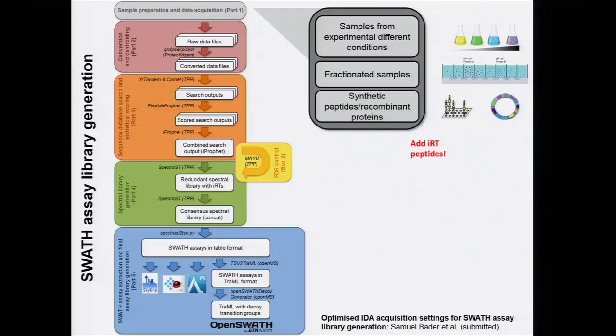But we basically add this in pretty much every sample we run in the lab that might ever have a chance of going into a spectral library. This is worth doing, or it can be any of the kits. Or Ariel also mentioned that some people have done work on finding peptides that commonly appear as contaminants, for example, from keratin or from filamentous proteins, or proteins that are highly conserved across species, or trypsin or something like this. And you just need to be able to find them all the time in every sample.